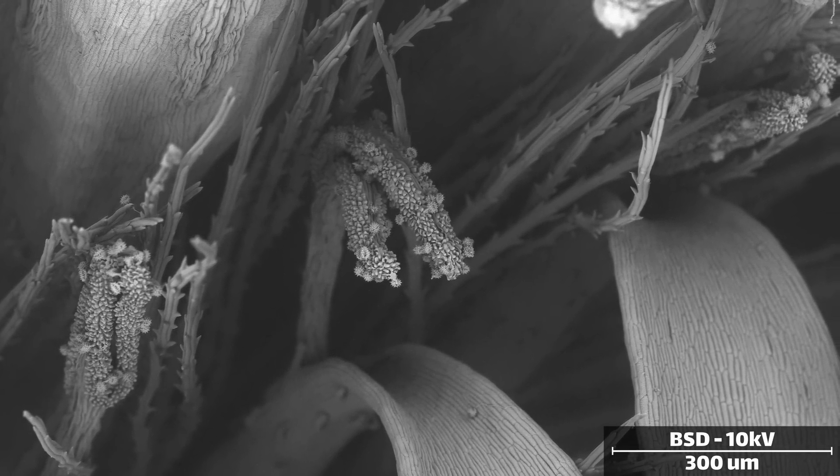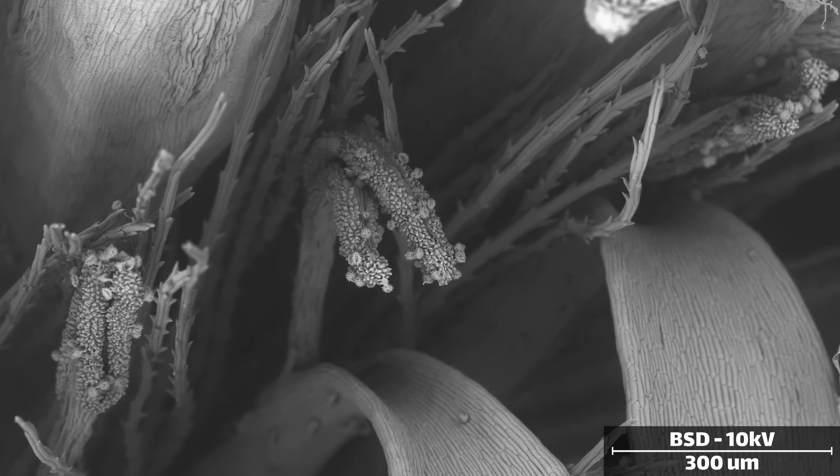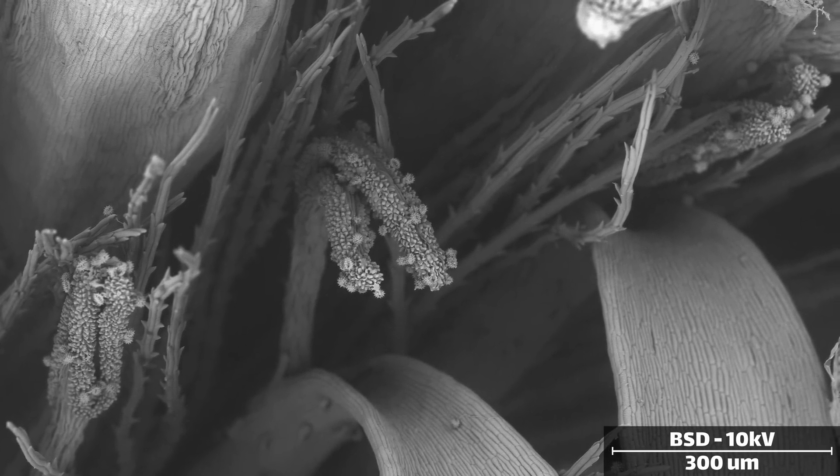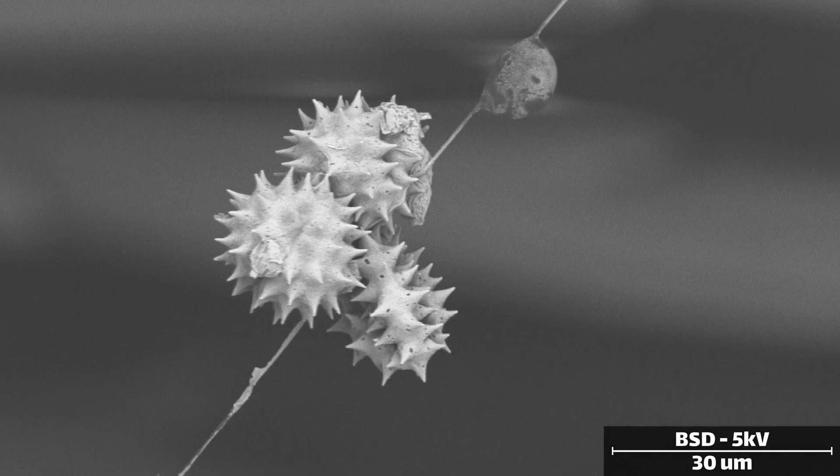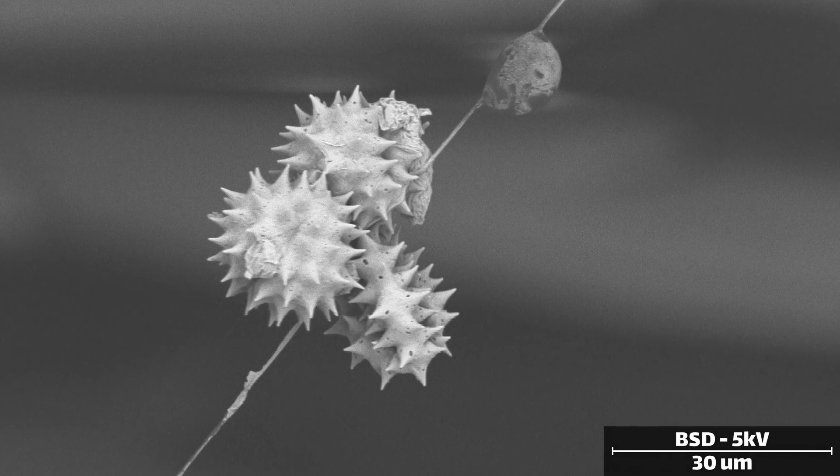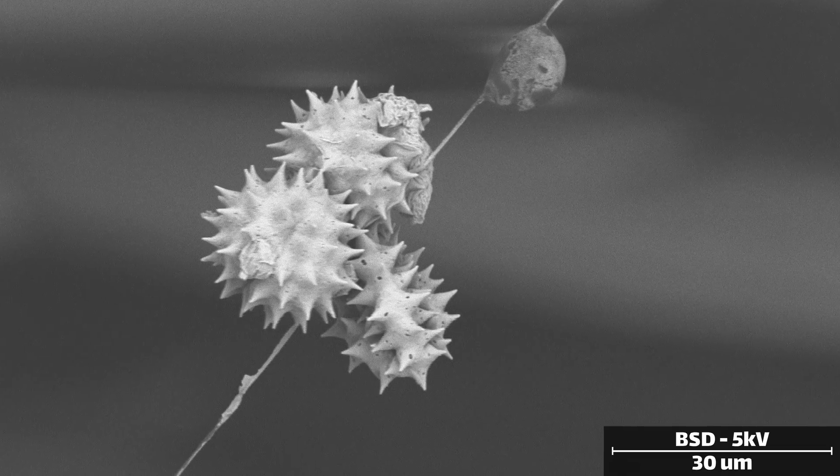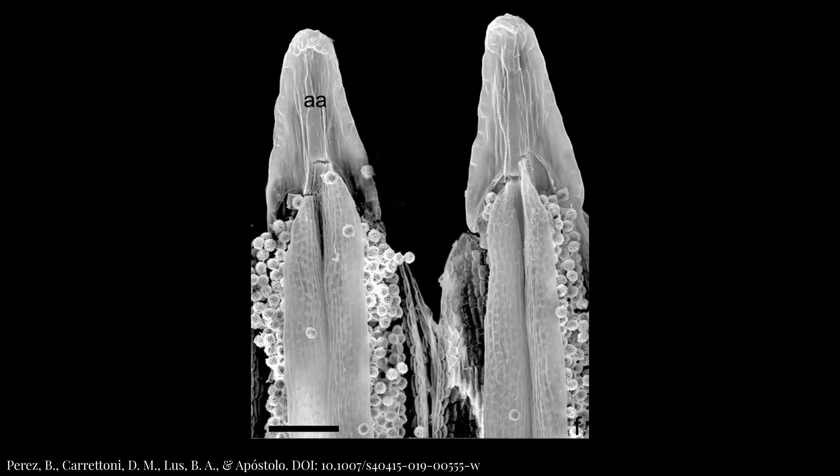I also struggled to find the male portion of the flower, the stamen, composed of the anther and the filament, which is where the pollen is produced. It's possible the set of flowers I collected were exclusively female, or past the point of producing male flowers. So instead, here's a representative micrograph that I found from the academic literature.